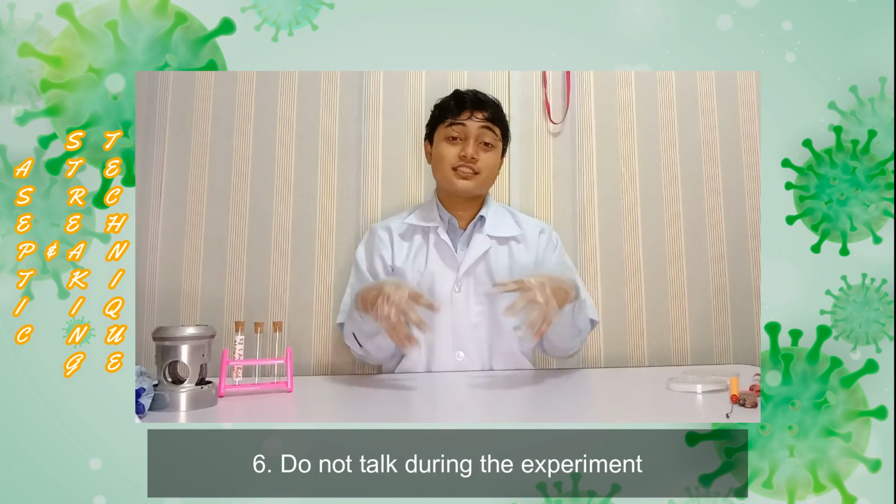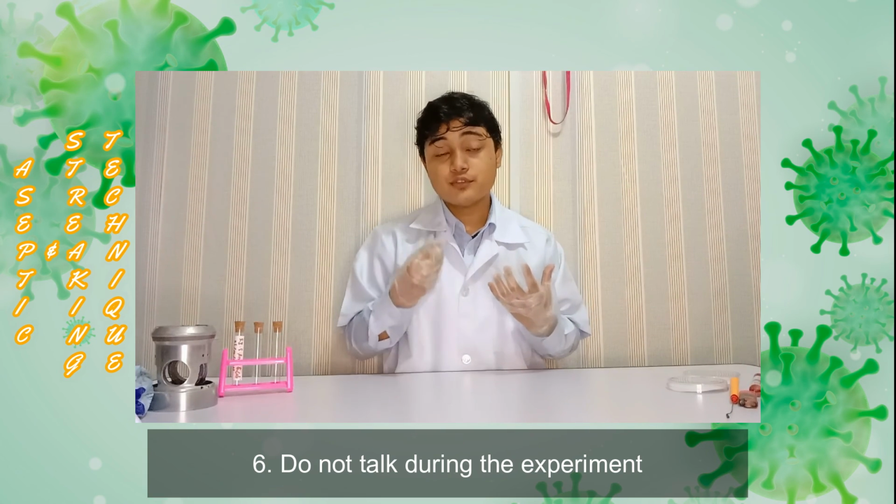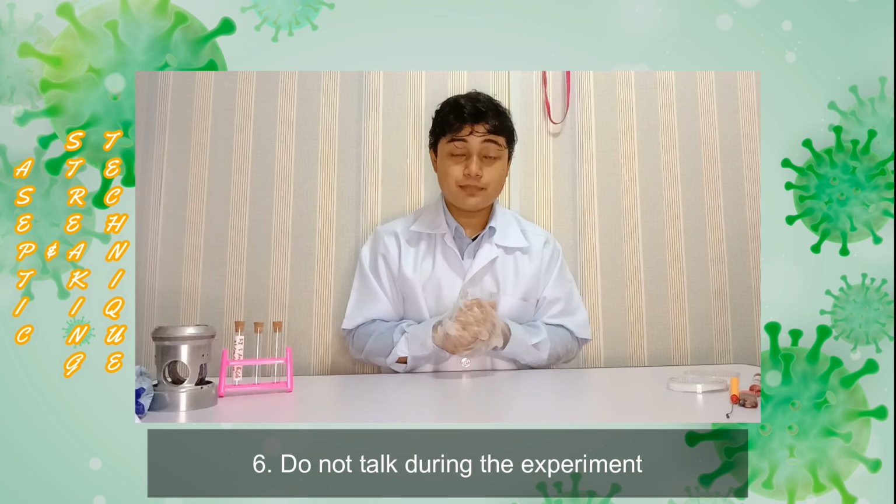Lastly, do not talk during our experiment because we don't want bacteria from our mouth to contaminate our agar plate and inoculating loop.